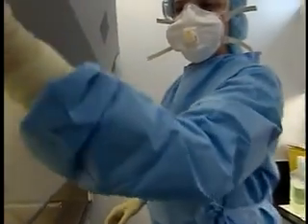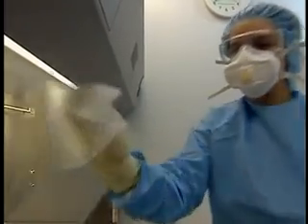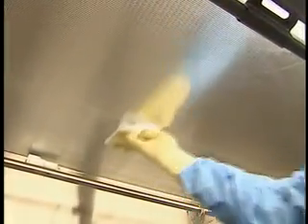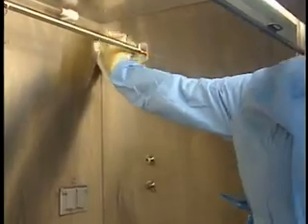Always start by cleaning the glass shield and then proceed in the order demonstrated here. It is important to wipe all surfaces with sterile gauze soaked with 70% isopropyl alcohol at the beginning and the end of day. Clean the work surface regularly and whenever a spill occurs. The cabinet is cleaned laterally using overlapping strokes and beginning closest to the HEPA filter.